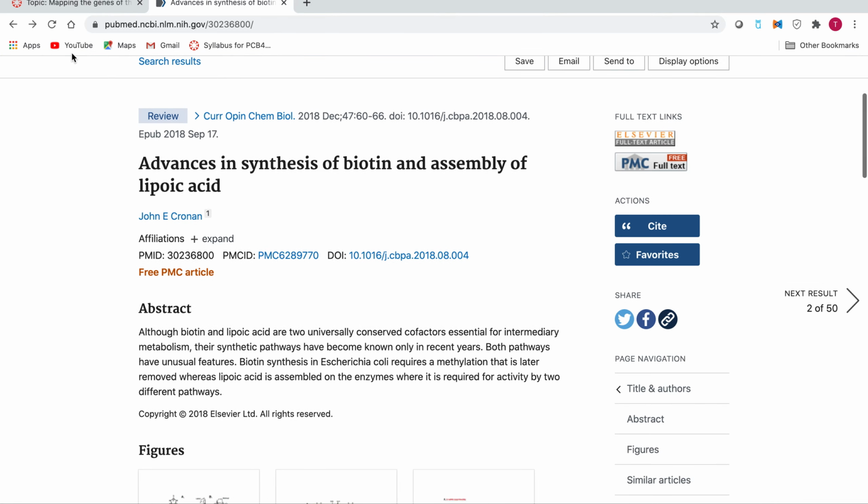And then it's going to load here. So you can see here, these would be the FASTA files that you can put into Excel and sort through. Oh, I'm so glad it came up. I've had trouble getting to this one only because for some reason it doesn't load, especially if it's super long.